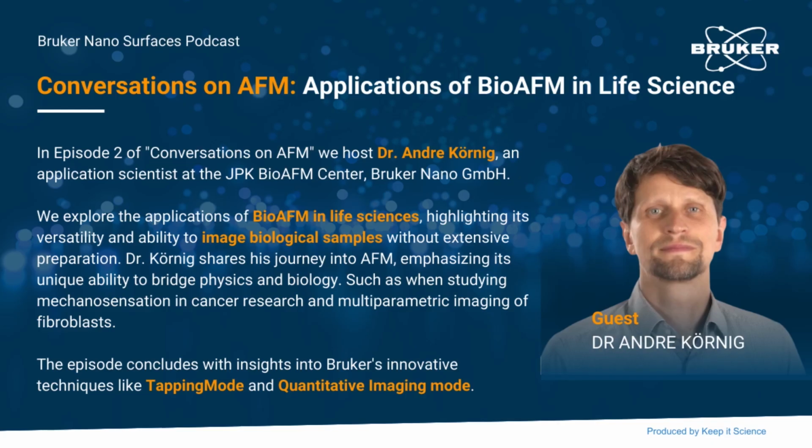The other trend is, well, in traditional AFM, it was just topography when it started. But then people realized, as I said, you have the finger and you can sense whether things are stiffer or softer. So a big topic over the last 5, 6 years, or maybe it started even 10 years ago but got more and more evolved, is mechanical analysis. So basically that you can differentiate between soft and stiff.